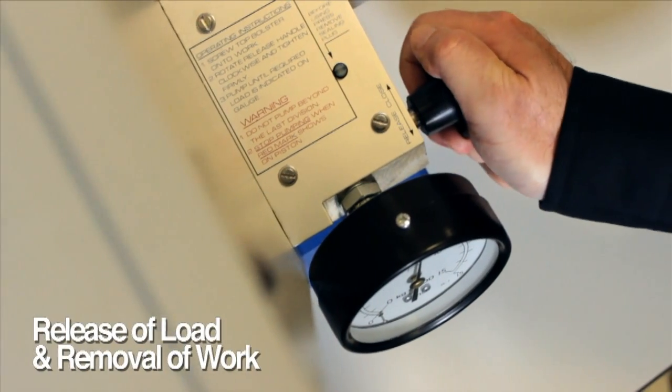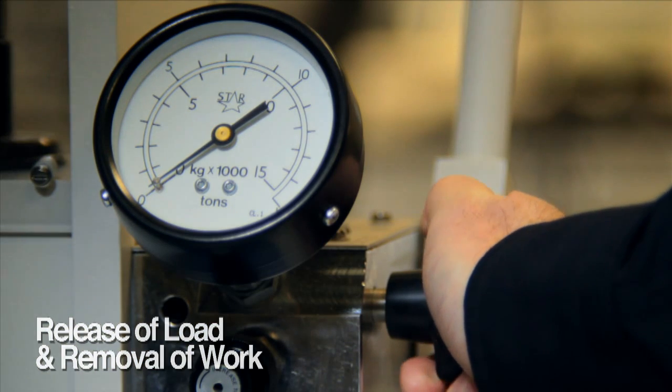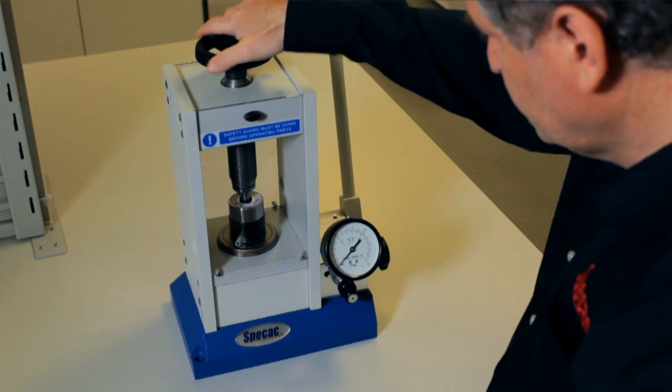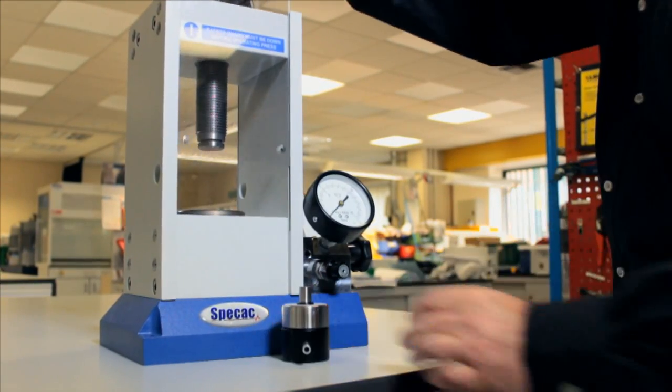To release the load on the work, turn the pressure release handle anti-clockwise by about one half of a complete rotation. There is no need to turn this handle completely open. When the tonnage load has been released from the work, it is safe to open the front safety guard and gain access to the work that has been pressed.